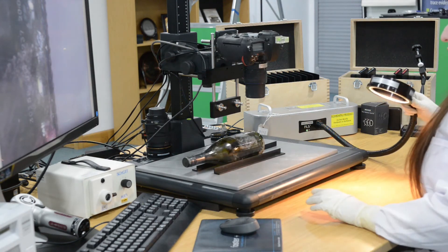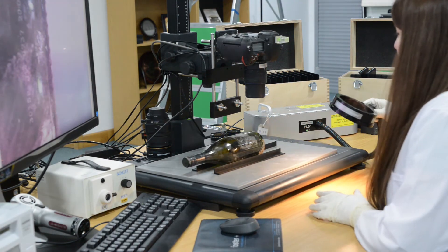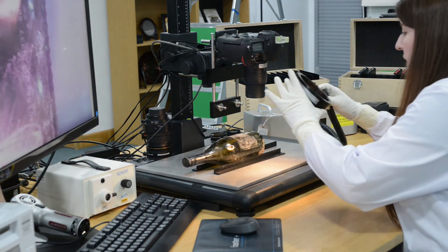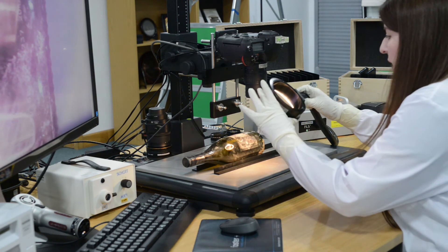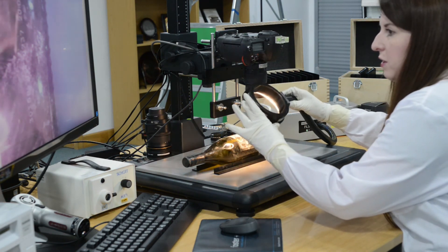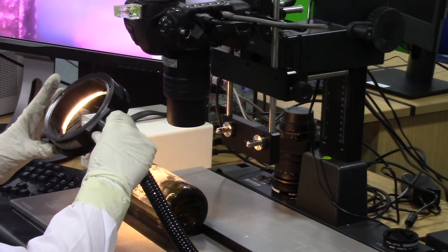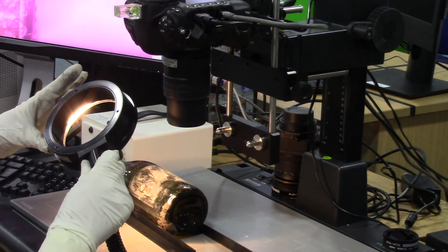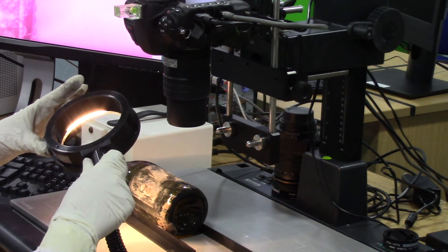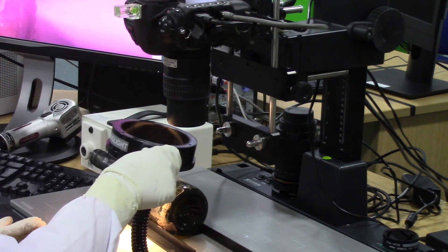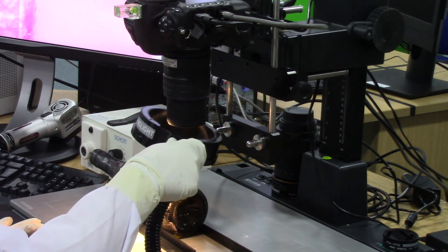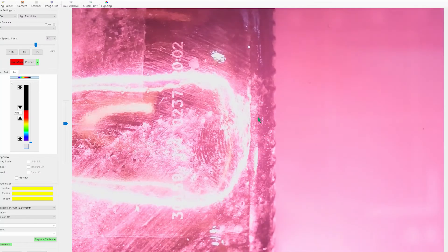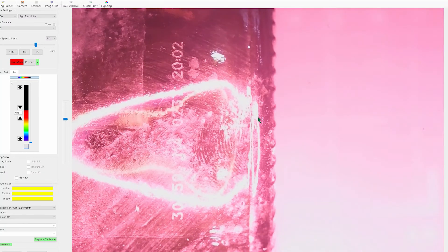For the final object that we're going to look at we're going to have a look at actually a glass bottle that's been recovered from this arson scene and at the base of the bottle we can actually start to see a finger mark developing.